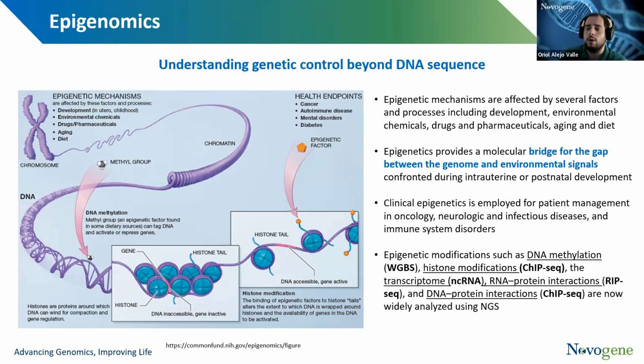Thanks, Larissa. Now the last question regarding the starting material, from Jin Kui. He is asking whether, to get qualified libraries from samples that have really low biomass, PCR cycles could be a solution. And he's asking whether that would lead to low accuracy when sequencing these samples.